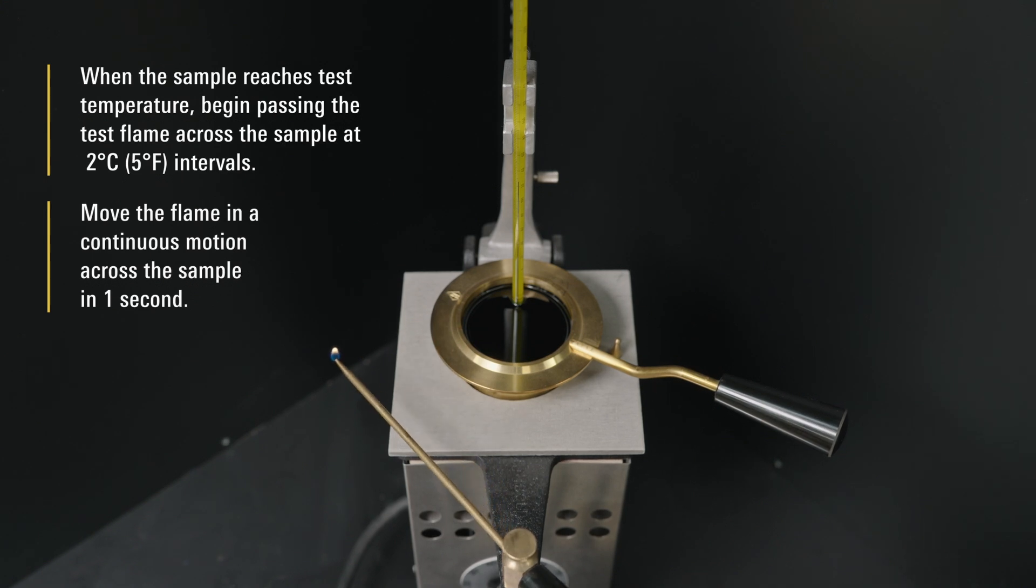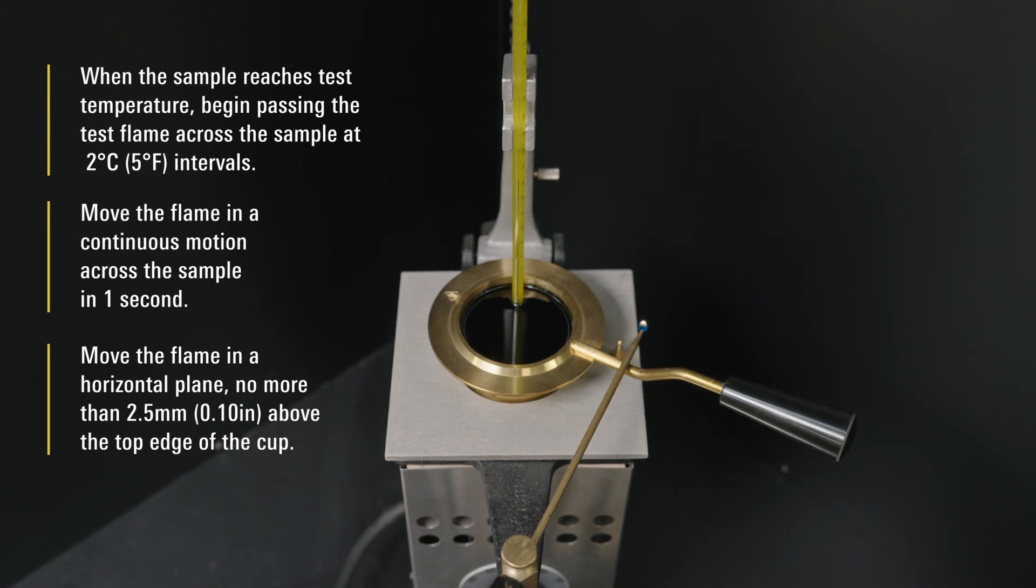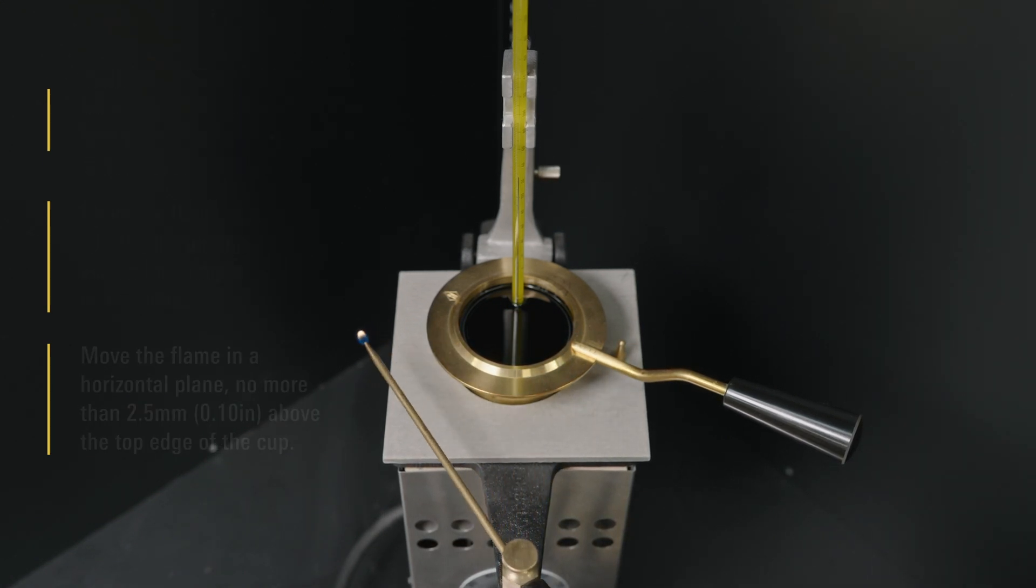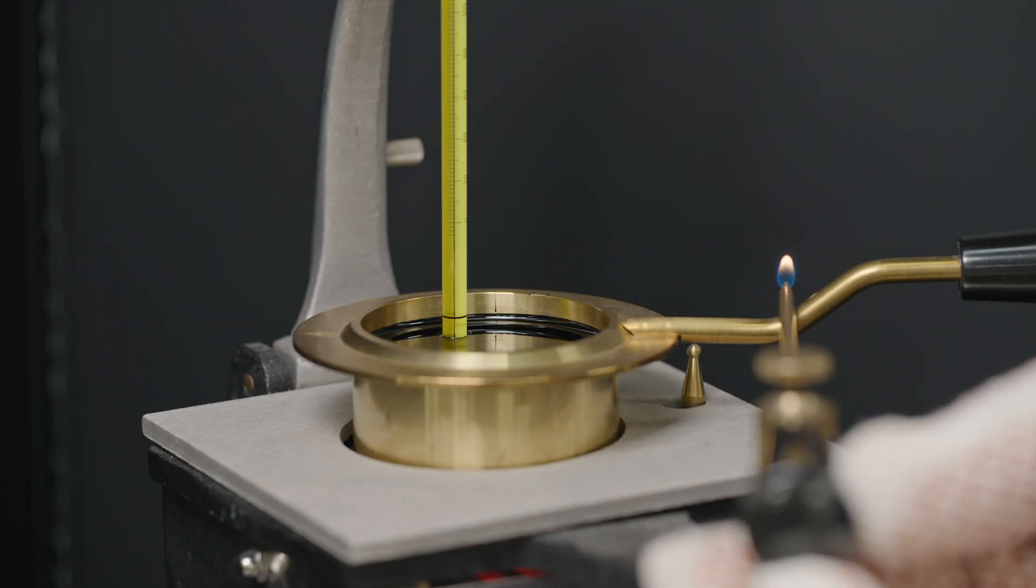Move the flame in a continuous motion across the sample in 1 second. Move the flame in a horizontal plane no more than 2.5 mm above the top edge of the cup. Move the flame in one direction for each pass, reversing direction for the next pass.